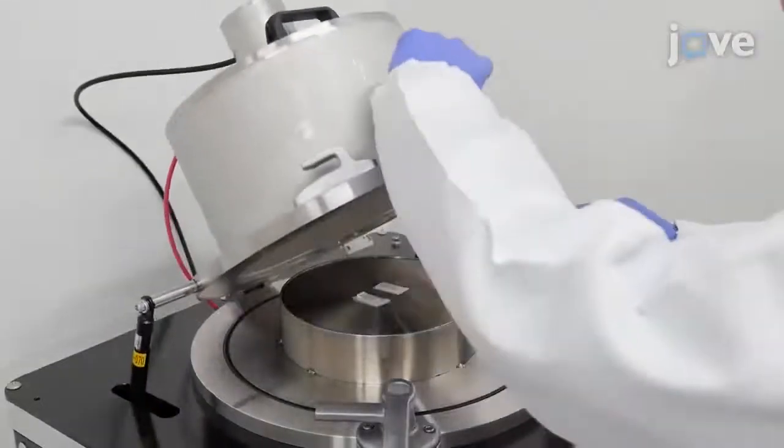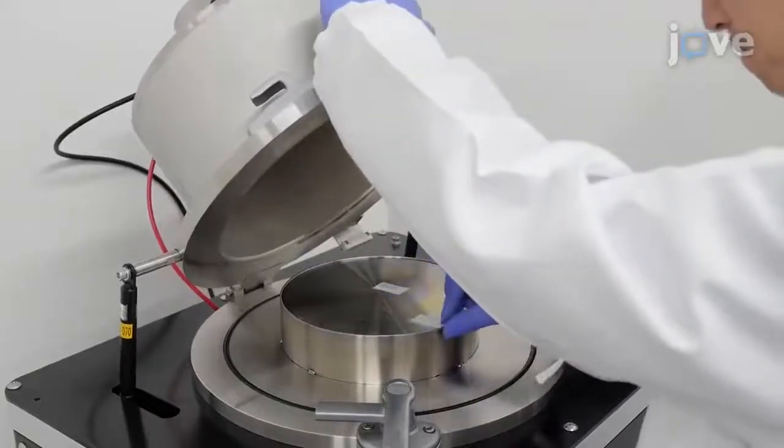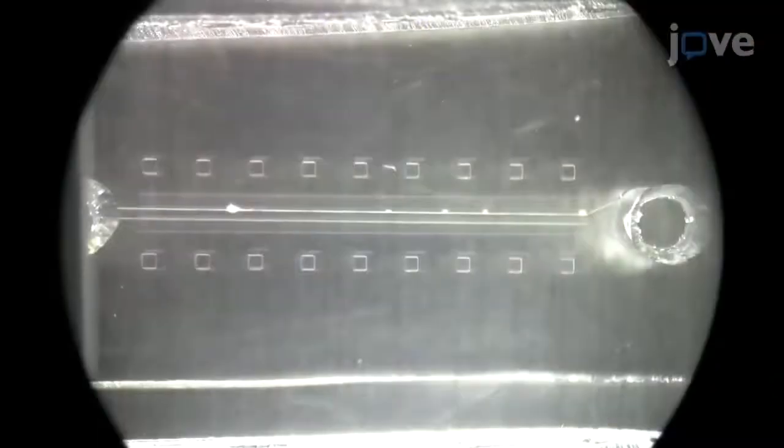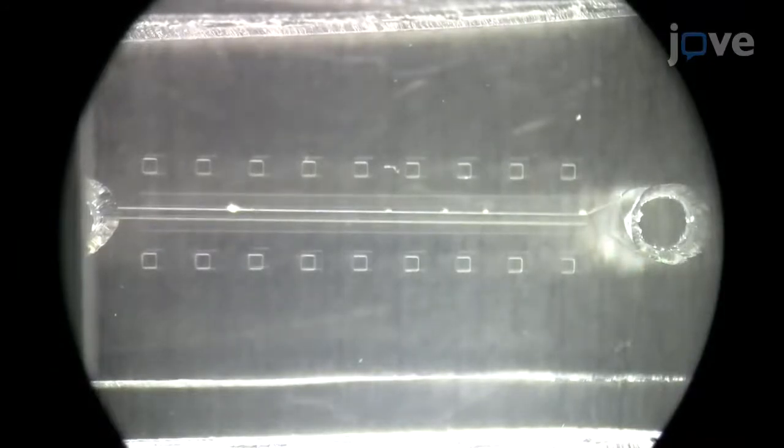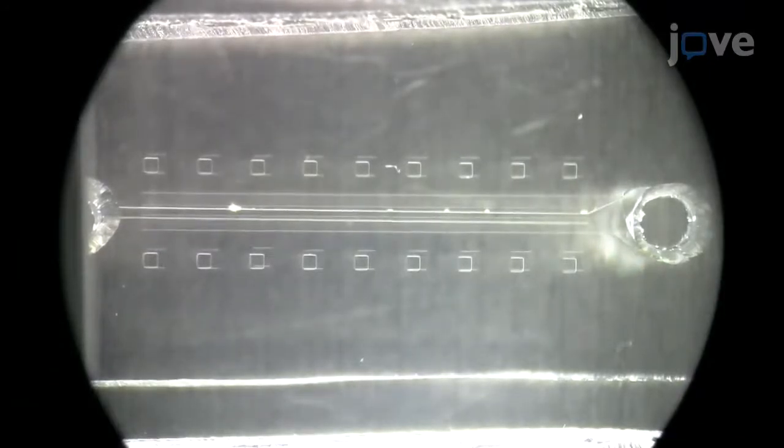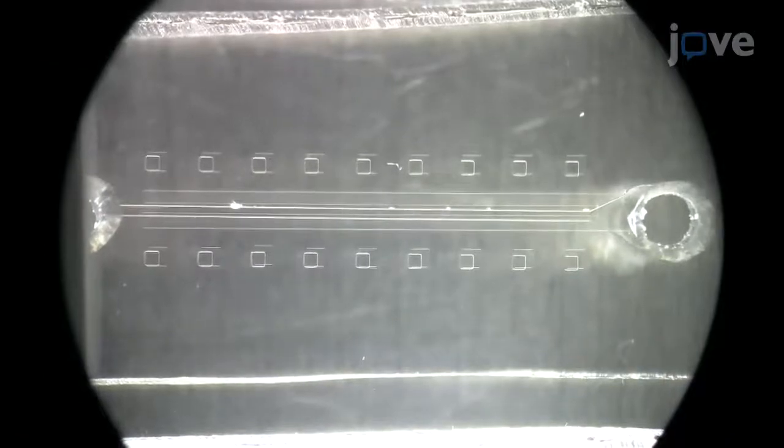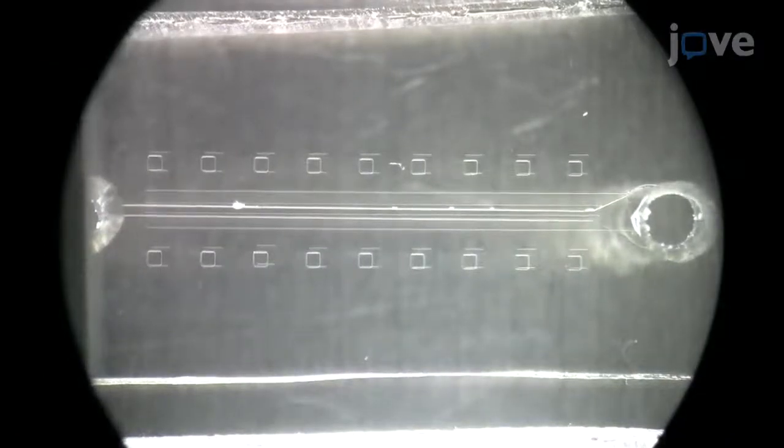After exposing both layers to air plasma for 50 seconds, join them together including a cover slip under a stereo microscope. Use the custom-made aligner tool to accomplish this. Cure the assembly for 30 minutes in the oven to seal off the microfluidic.